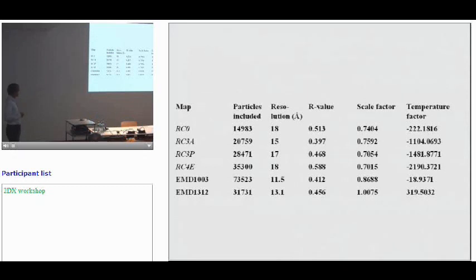And indeed, for this particular structure, you get a plus value. So maybe they have boosted it up a little bit too far. Well, there are no error figures here on the temperature factor, so maybe it could also be close to 0.